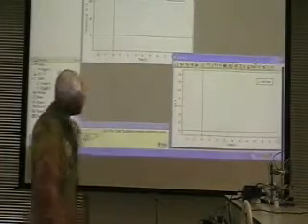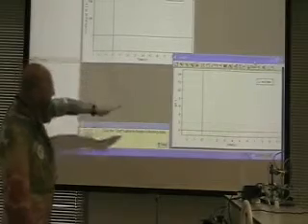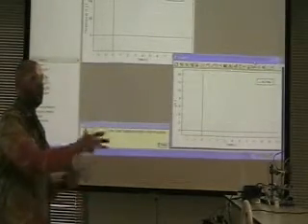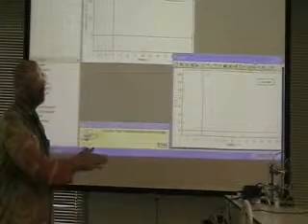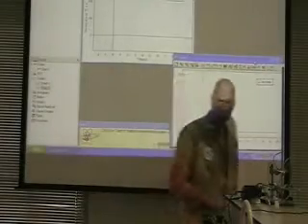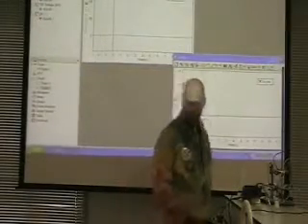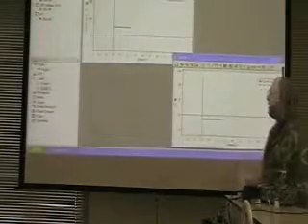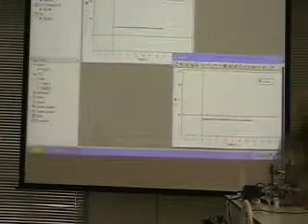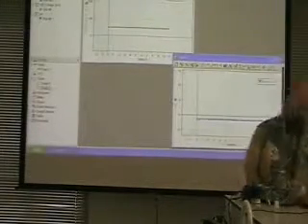Now, theoretically, temperature will be going up because the reaction releases heat, and pH will be going up because acids are very low in pH. If I react the acid away, then the pH will rise. Theoretically. Let's see what happens. Now, as usual, I will start so that we have a baseline. Notice we already have a little bit of a problem. We're reading negative pH, which is theoretically impossible, but that's because I haven't calibrated this thing.